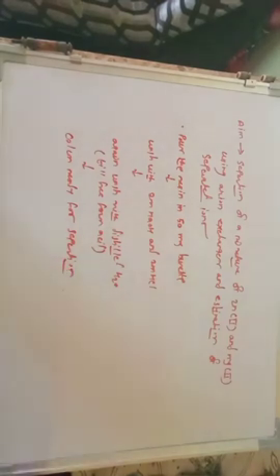So the simple procedure is that you have to take 10 gram anion exchanger resin for separation of the cations zinc(II) and magnesium(II), wash with water and allow to soak for swelling overnight. Then pour in a 50 ml burette, wash with alkali and then with acid, and then again wash with distilled water till free from acid, and then it is ready for the separation. Let us discuss the second point, that is separation of zinc(II) and magnesium(II).